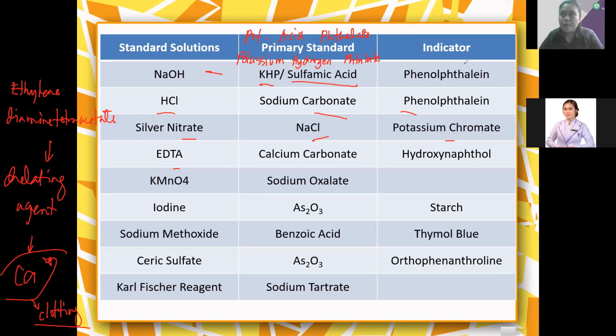Why? Remember, if maraming moisture, it will be prone sa contamination. Kasi yan ang gusto ng microorganism. If merong water, talagang magta-thrive ang bacteria dyan. So yung mga substances natin, kailangan natin sila i-dry and i-test natin yung moisture content. And that is itong Karl Fischer reagent, one reagent used for moisture content determination of our chemical substances.